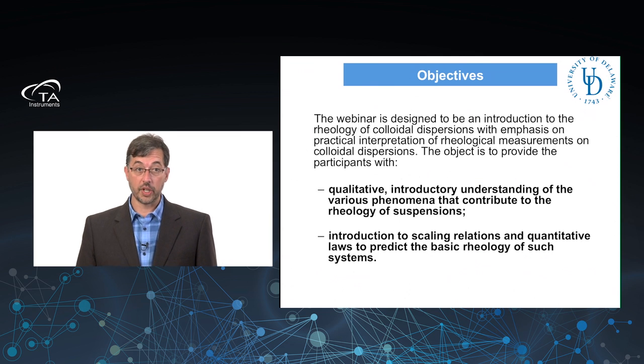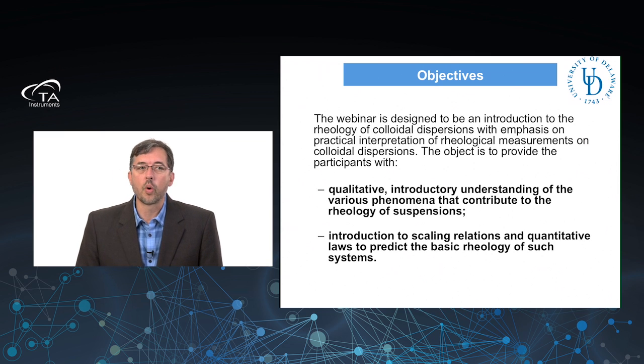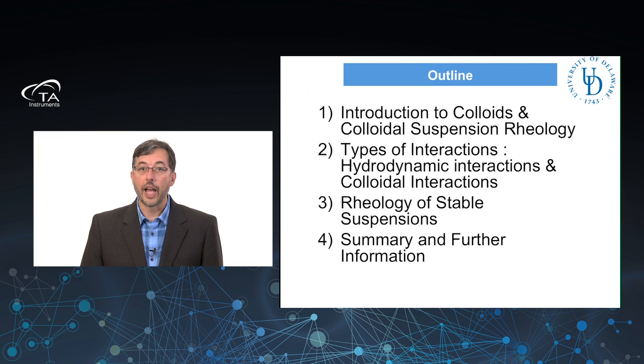Now, the objectives of today's webinar are to provide you with a qualitative introductory understanding of the various phenomena that contribute to the rheology of colloidal suspensions. We're also going to make an introduction to basic scaling relationships and quantitative laws to predict the basic rheology of such systems.